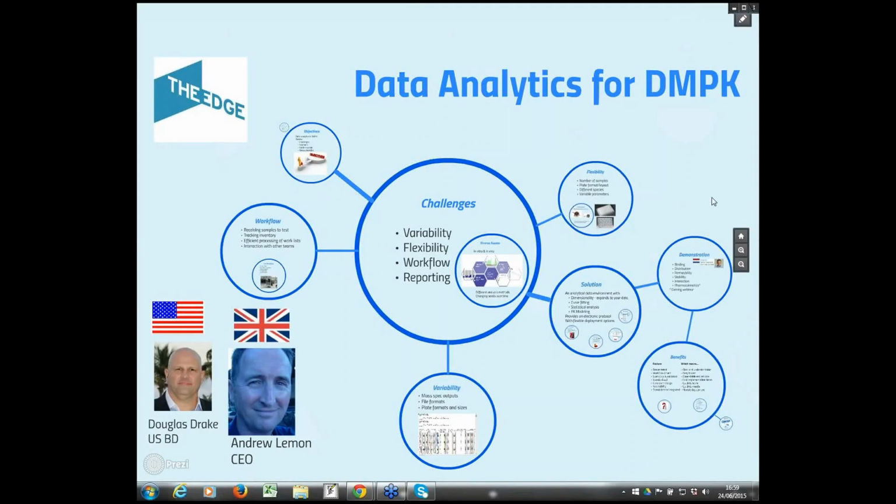I want to welcome you to our first, actually, in a series of webinars using the BioRails platform with Morphit, which is an extensive platform for any type of biological sample management, assay management, and so we are actually going to be illustrating how this can be used for a variety of different drug discovery processes, both from genomics all the way to early safety and efficacy. But today we're focused on the analytics for DMPK and ADME, so I appreciate you joining us.